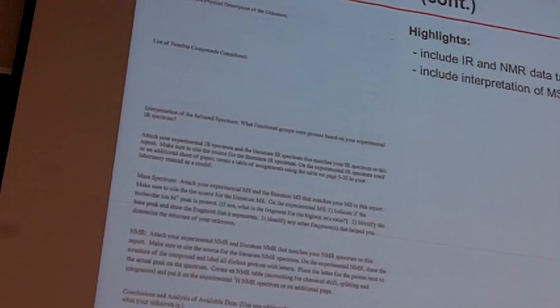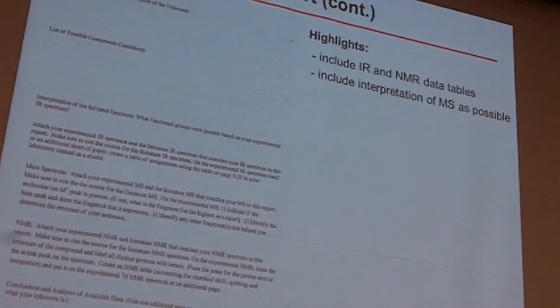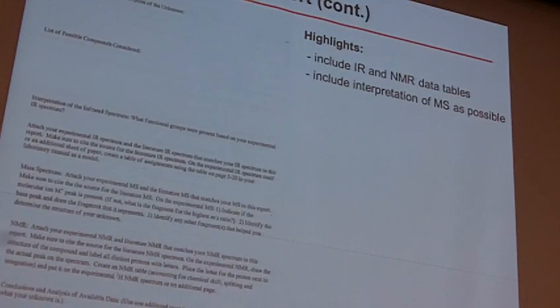Okay, you want to include IR and NMR data tables. Just like we talked about last semester with the IR, we will tell you that next week with your NMR. Be sure you include your spectra and the data table. Include the interpretation of the mass spec. I would say do that right on the mass spec that you get. Kind of highlight a little bit: this fragment means this, this is the molecular ion peak. Hit the highlights there.